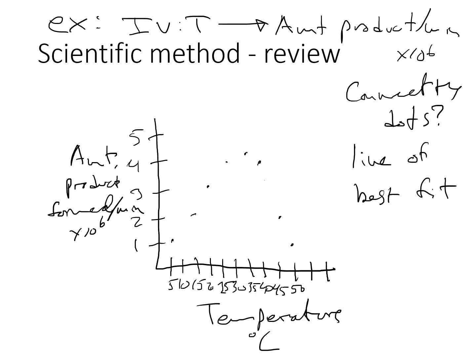So does that mean that you should, like in our first option, option 1, connect all the dots? All right, I'm going to connect them. Do you really think that is an accurate representation of how the amount of product formed in the first minute of the reaction responds to temperature? I doubt it. Something funny happened here, and my suspicion is that's the real data. So you will often get what's called outlier data, like what I just showed you. And a line of best fit is a much better way of dealing with that. So we're not going to do the childlike connect the dots. We're going to do that.